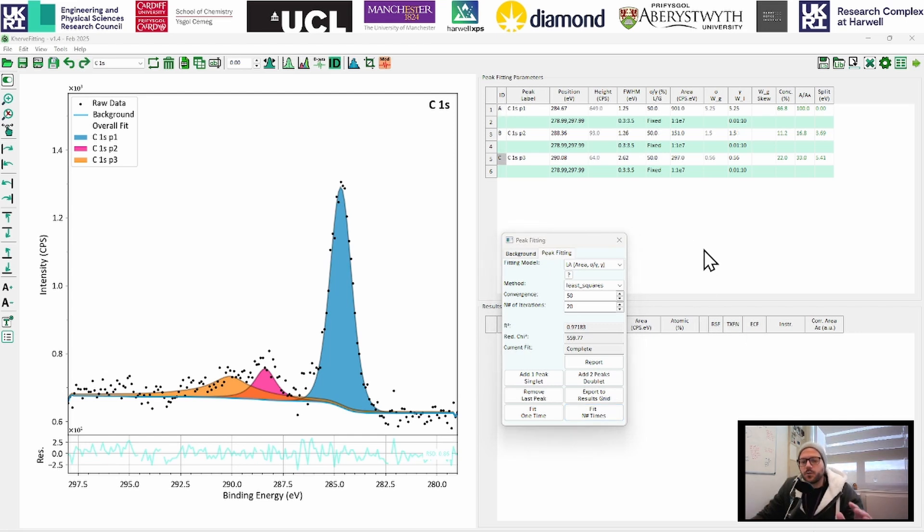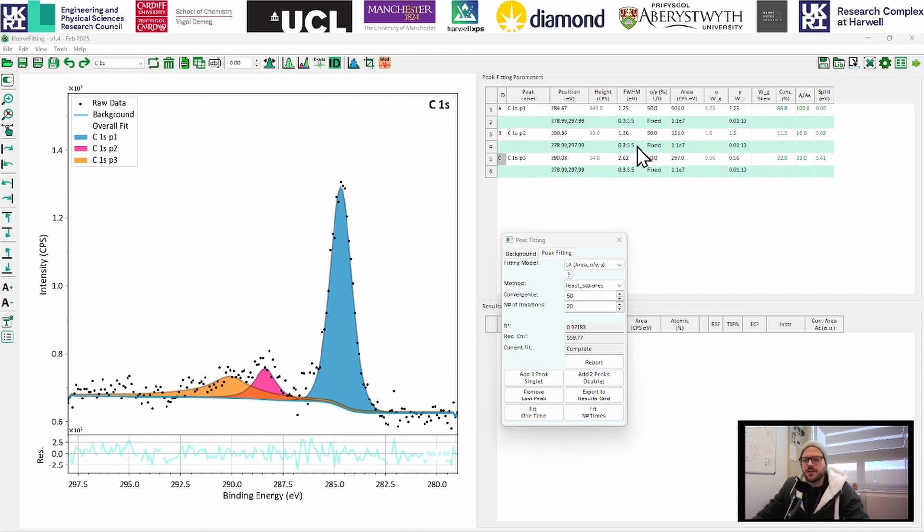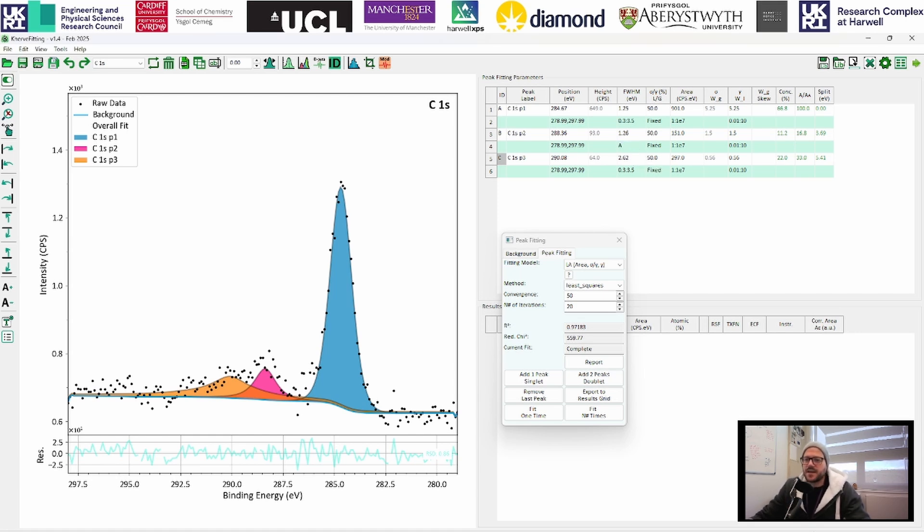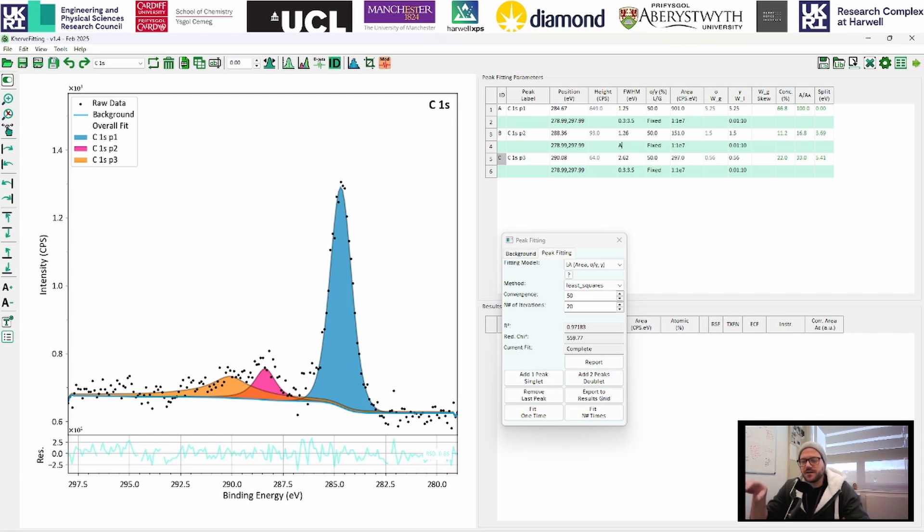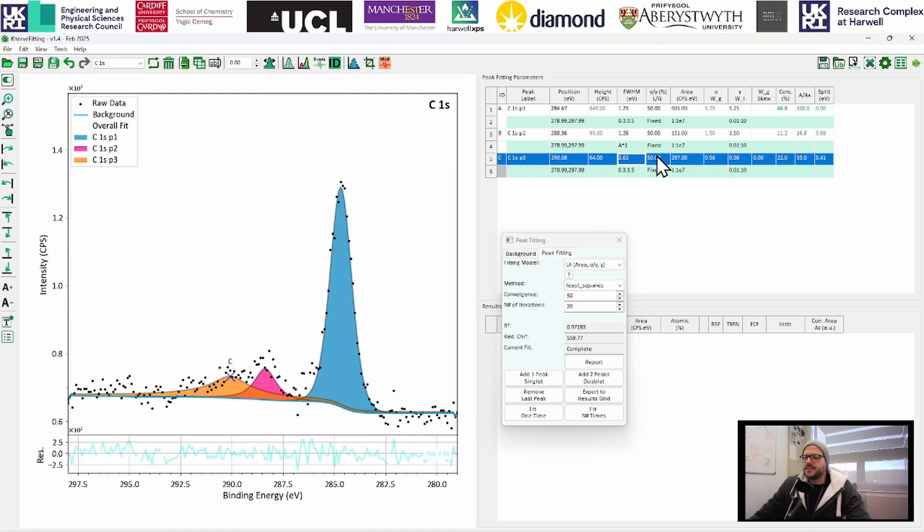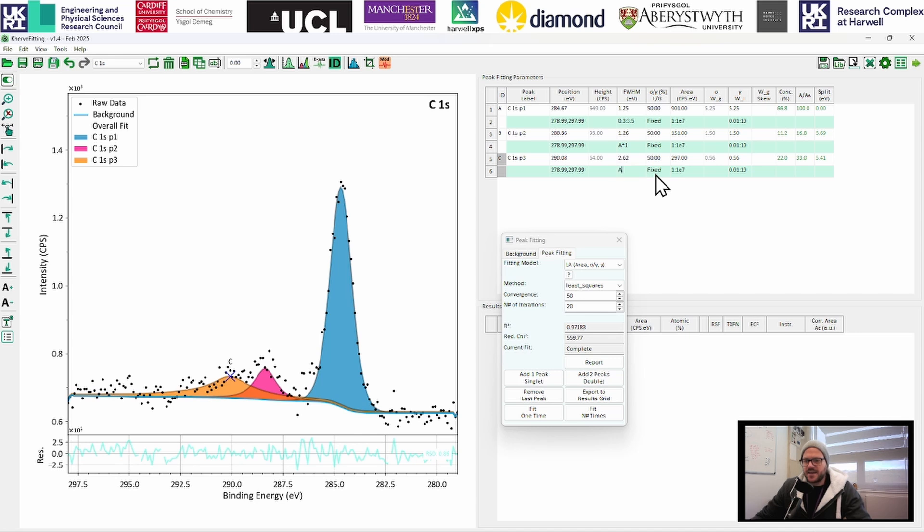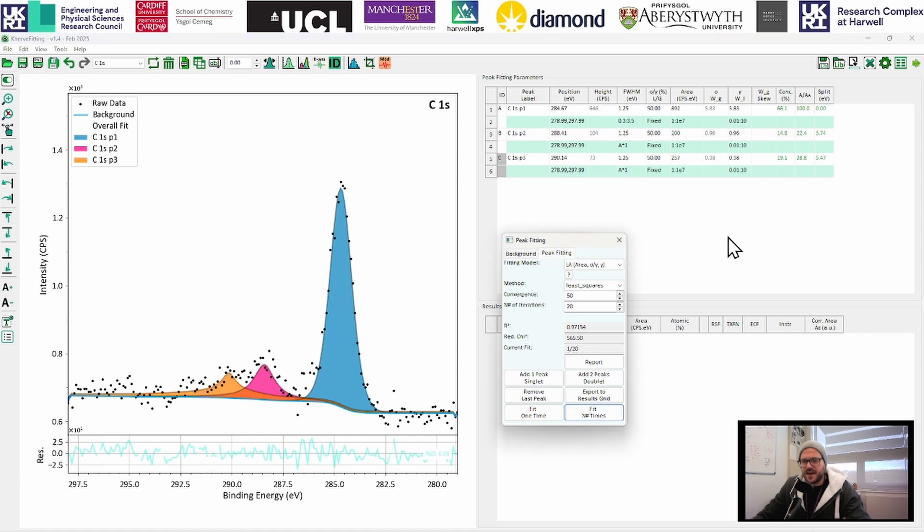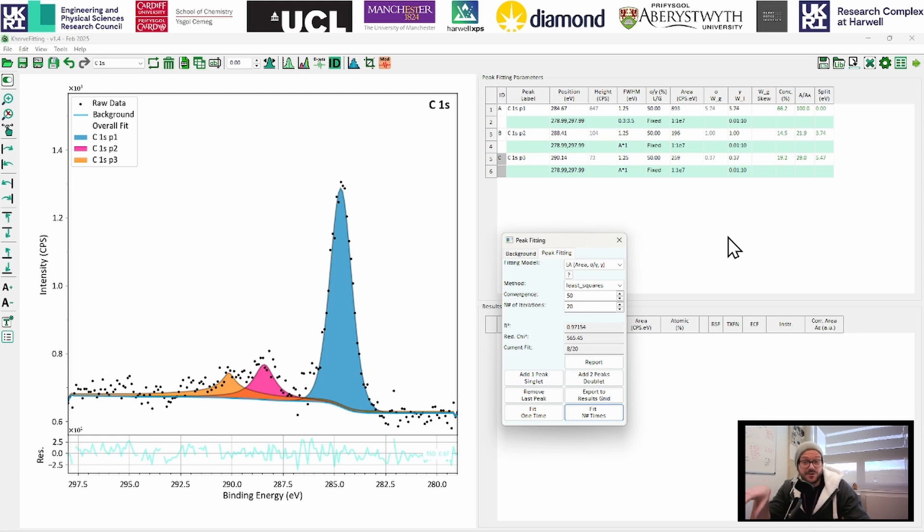So we have our initial peak model in. But of course, now we want to apply some of our constraints. So same as in CASA, same as in Avantage, we can lock some peaks together. So in the green rows, we have some of our constraint parameters. I'm just going to type A into the full width at half maximum constraint box here. And now everything should lock together. When we click fit again, now you can see all of the full width at half maximum set to 1.25. And it still looks a little bit odd. But we can work on those.